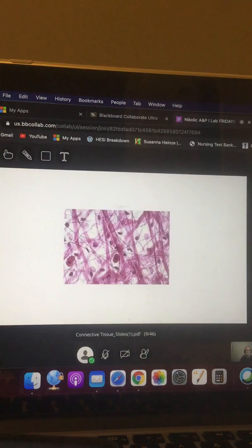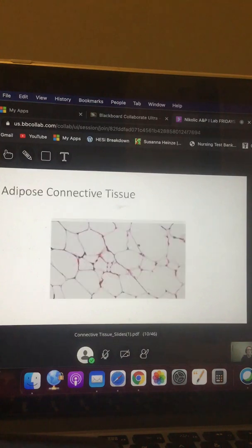So we did that. So here's another example. It's the same thing. This is a great example, right? Because you've got fat ribbons, collagen. You've got the thin lines, elastic fiber. You've got the ground substance, everything in between. That's basically white. Yeah, this is a pretty image. So, all right, awesome. So we are going on to the next type of tissue.